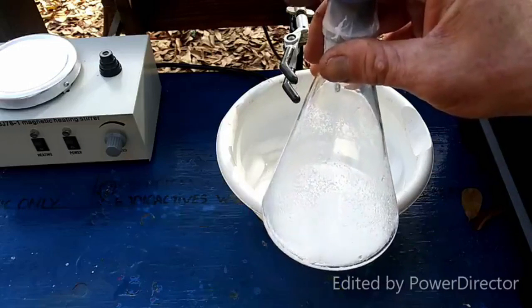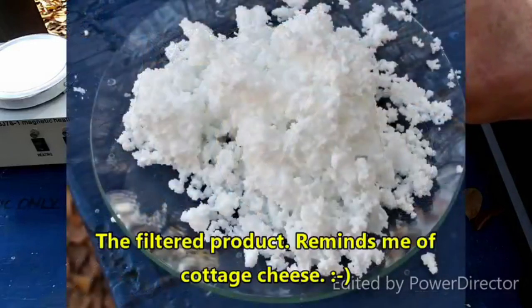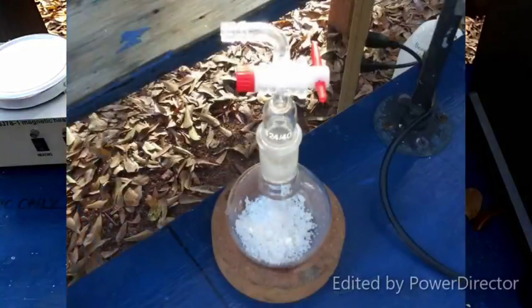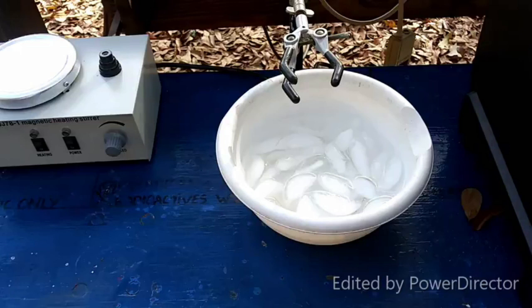The proof will be when I try to do the uranium(IV) oxalate synthesis and whether or not it works. I'll be making up a fresh batch before I try that. Before I use my last three grams of uranyl diacetate, I'd really like to know it's going to work. It's supposed to produce a nice green color, which sounds pretty cool — so that's really it.